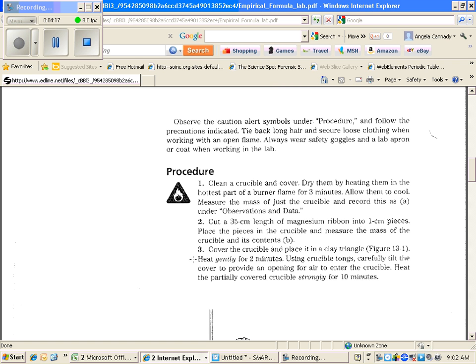It says heat gently for two minutes and then strongly for 10 minutes. In other words, the two minutes is to let it get burning. Hopefully, that's when you'll have the glow started when it's covering. Then, if you'll notice in this step, it says using crucible tongs, carefully tilt the cover to provide an opening for air to enter. That's so the oxygen can come in and start reacting. Heat the partially covered crucible strongly for 10 minutes.